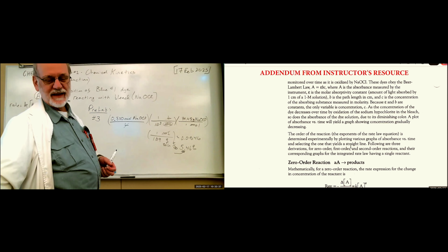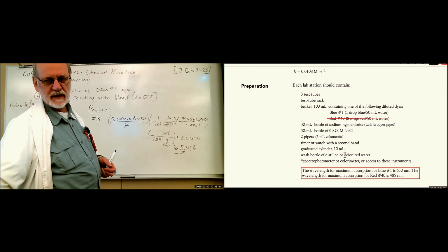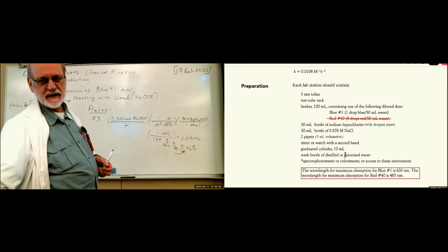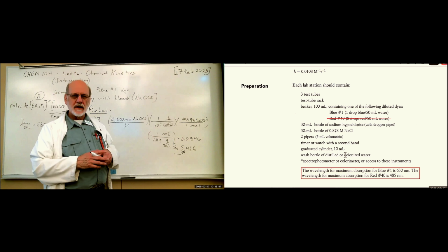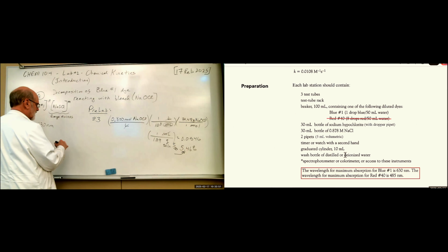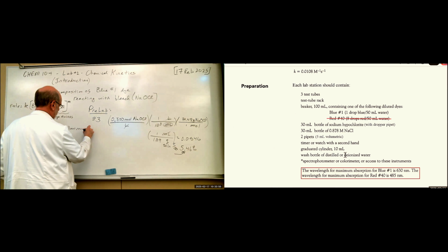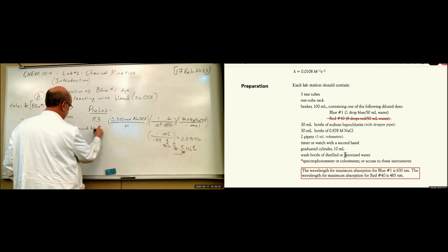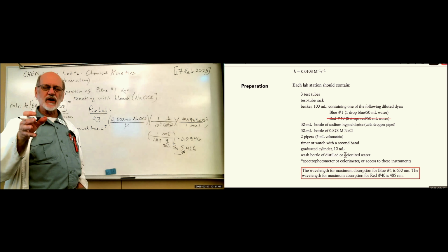Okay. So you need to set up your notebooks so I can check them. The first step in the experiment is how much bleach? How much bleach to decolor?